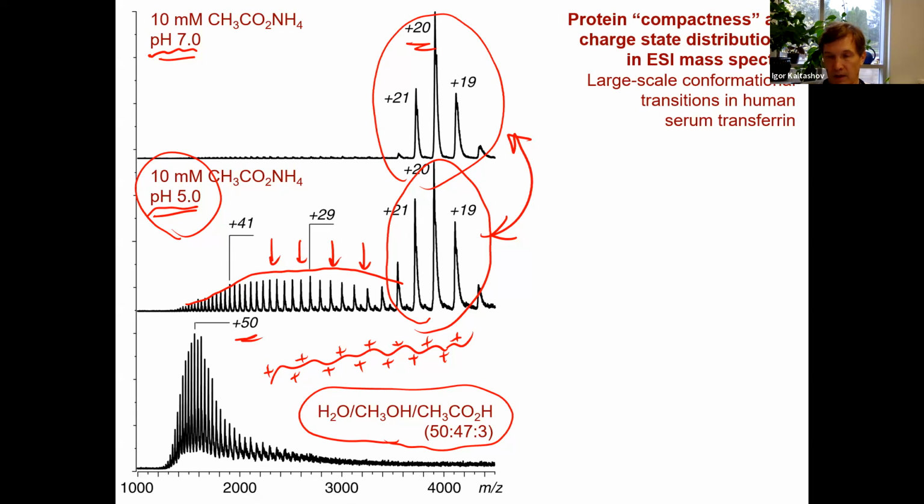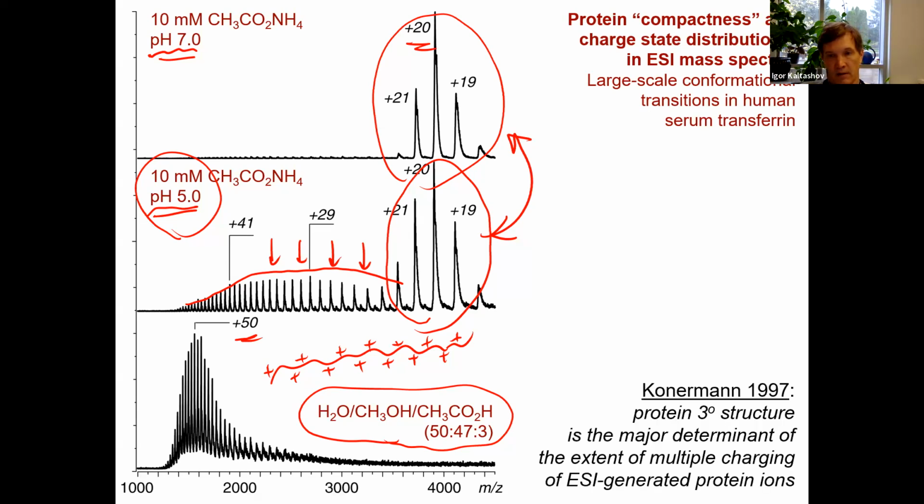Okay, so this phenomenon has been observed and rationalized a fairly long time ago, nearly 25 years ago, and it is now used very commonly, routinely, I would say, as a means to evaluate conformational dynamics of proteins under a variety of conditions.